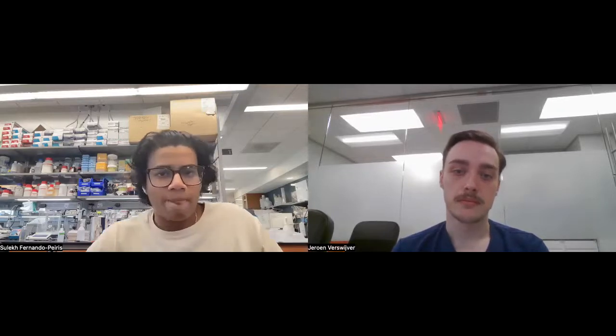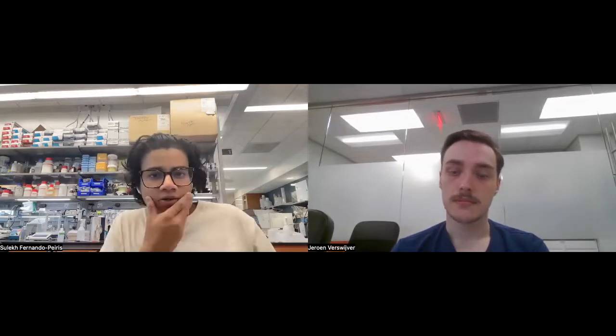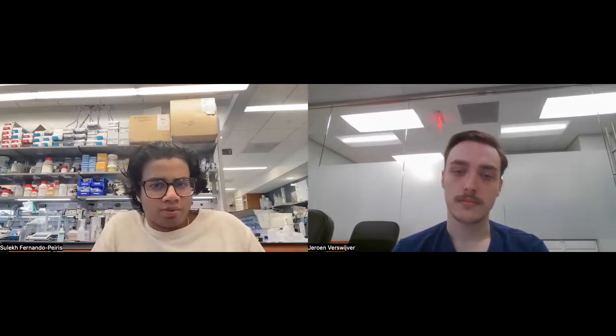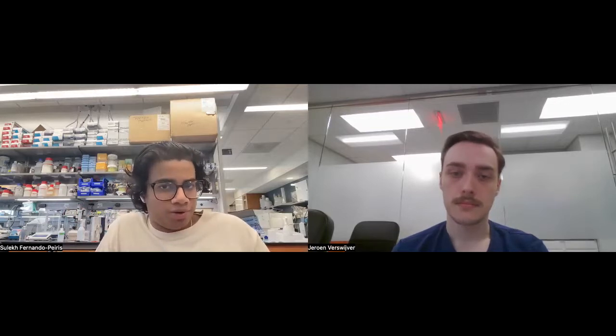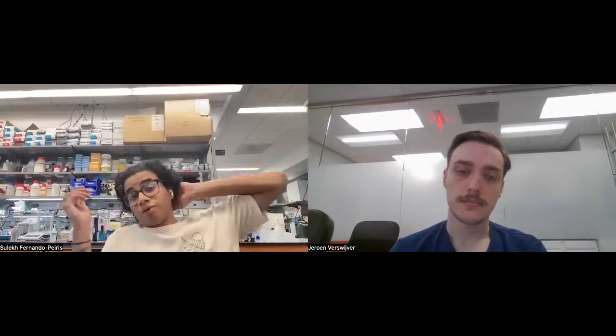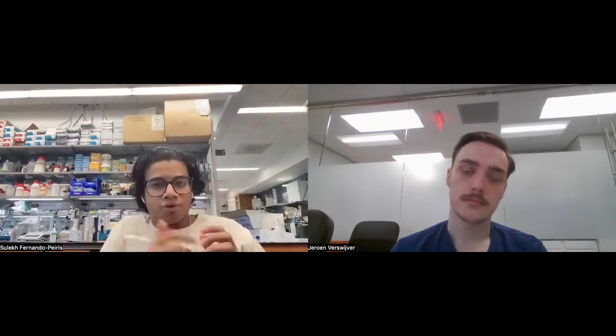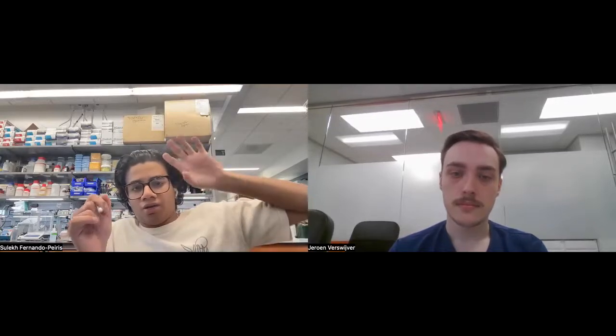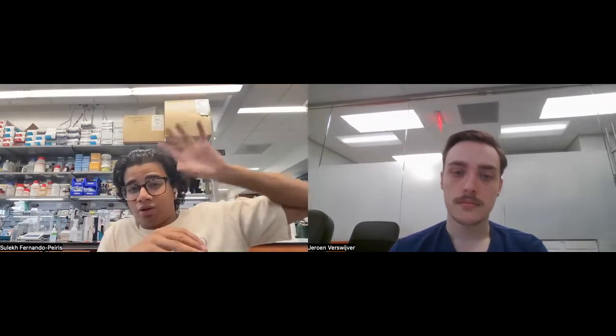Yeah, that kind of leads to my second question. I think I mentioned we work with a lab at Columbia, the Costa Lab, who uses DataJoint, and they designed their own GUI. One part of their GUI that we found really helpful, and a lot of our lab members were enthusiastic about, I don't know if this is what you were talking about, Jaron, is that you can click numerous subtables under a bigger schema.